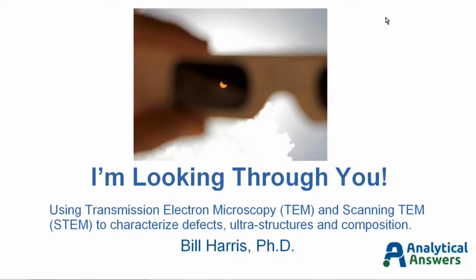We are here at Analytical Answers, a company which has been performing materials and failure analysis for more than 25 years. Over that time, they've completed over 50,000 analyses, a high percentage of which deal with structural characterization, cross-sectioning, and thin films. We will discuss our newest capability today, Transmission Electron Microscopy, which allows us to take these analyses further into the nanoscale. We're going to discuss TEM today with Bill Harris, a senior scientist here at Analytical Answers.